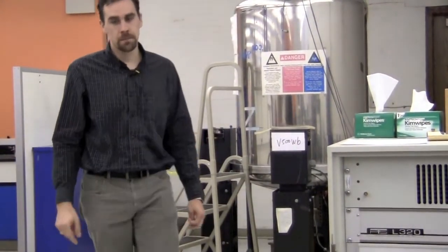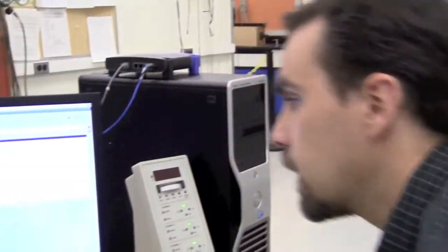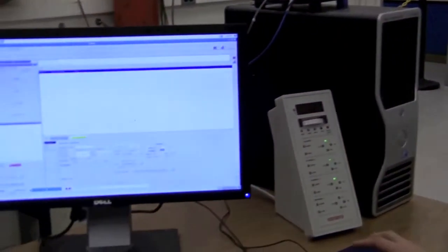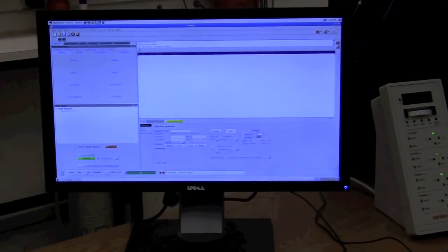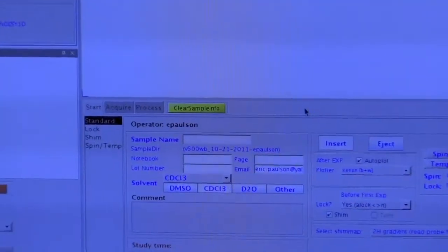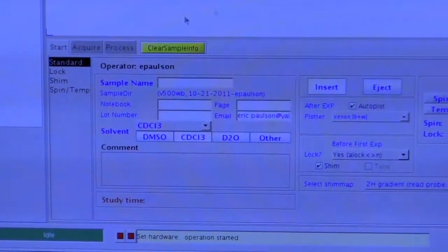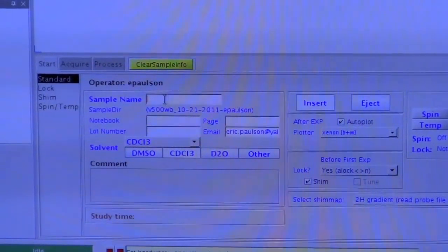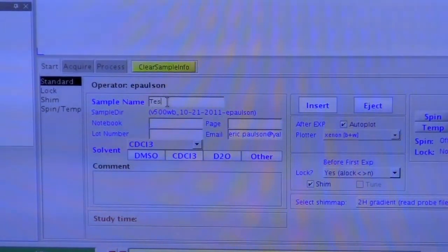And then you can come back to the instrument and hopefully by now the study queue has been created. So now we can click insert and our sample should go into the magnet. So the first thing we want to do here is put in a sample name. This is required. It needs to have a sample name for every sample.